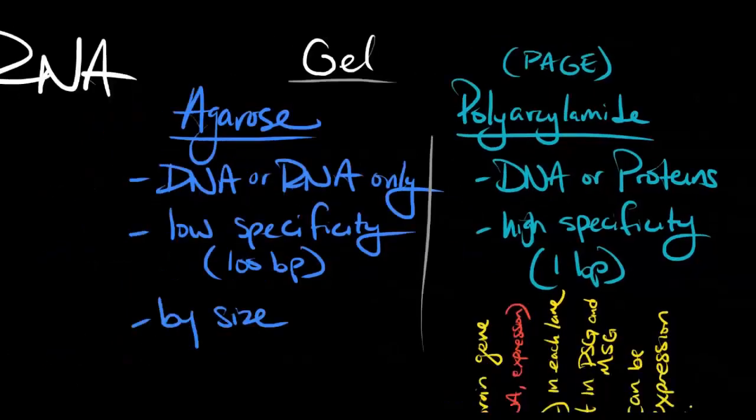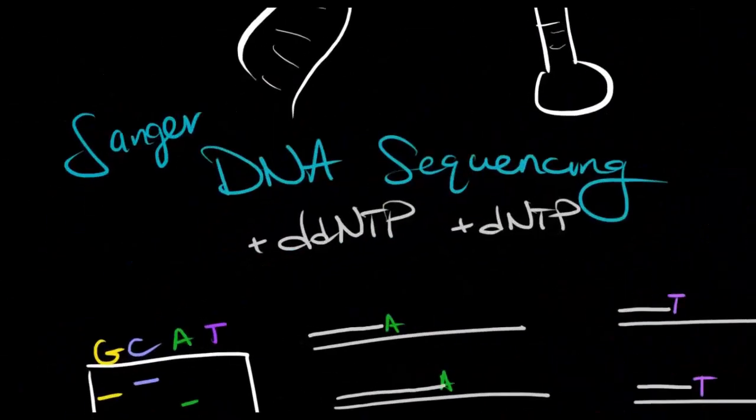Knowing that, let's talk about Sanger sequencing, which uses PAGE to determine the sequence of a segment of DNA. Traditionally, this process required one type of ddNTP and the 4 types of dNTP. Because ddNTPs are missing the 3' oxygen, they cannot have additional nucleotides added to them. When ddNTPs are used in replication, which we'll talk about more in week 5's material, they produce segments that are prematurely shorter, essentially stunting the elongation of the new strand.